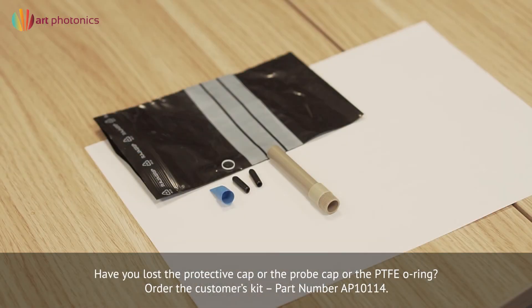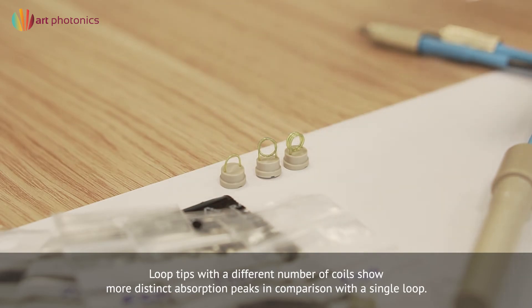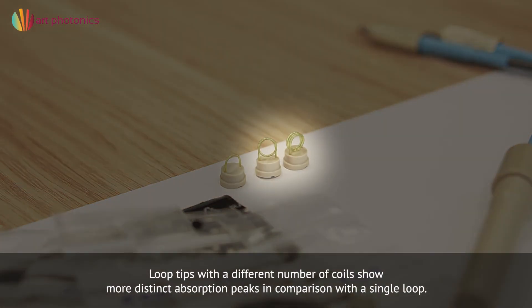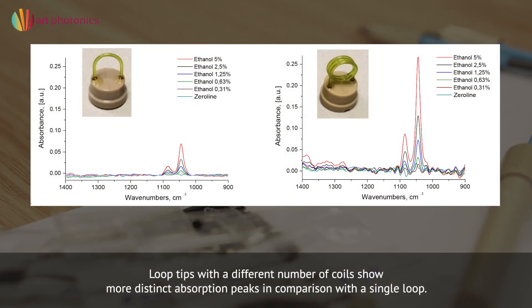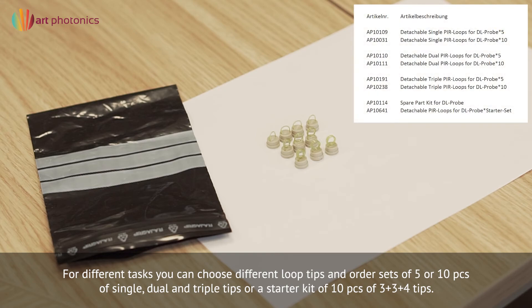Have you accidentally lost some of the detachable parts? Order the customer's kit. We provide loop tips with a different number of coils — dual and triple loop tips show more distinct absorption peaks in comparison with a single loop and are more effective for diluted solutions. You can order sets of 5 or 10 pieces of single, dual, and triple tips, or a starter kit of 10 pieces in a 3 plus 3 plus 4 configuration.